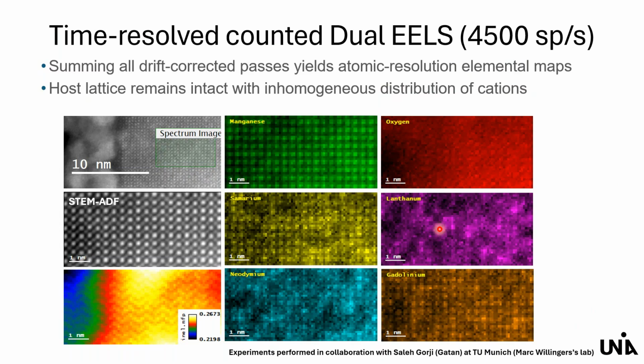It confirms the stability, and also the thickness map confirms that there is no significant degradation of the sample. I guess that's the important thing, that you can observe the sample quality or the beam damage in situ, and that's maybe more important to judge the final data quality and reliability.